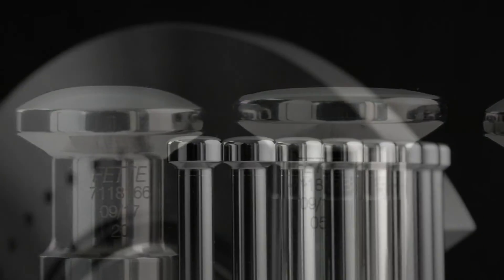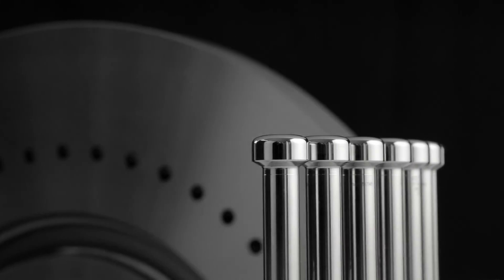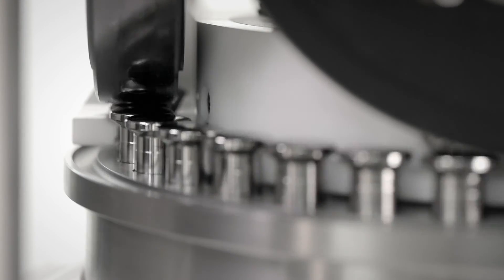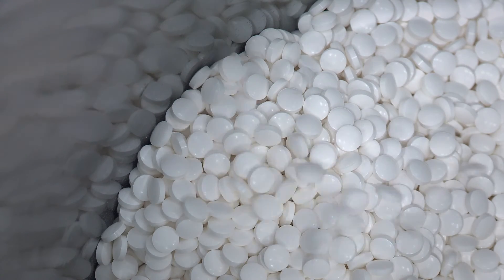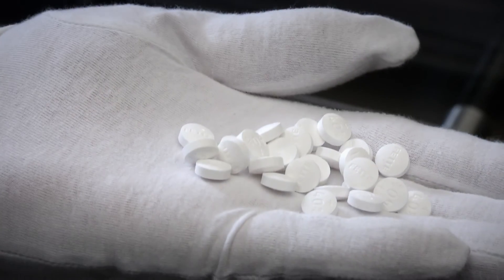The high quality of the tableting tools is reflected in the perfect interaction of machine, turret, and tools. And you get that from us - perfectly coordinated and from a single source.